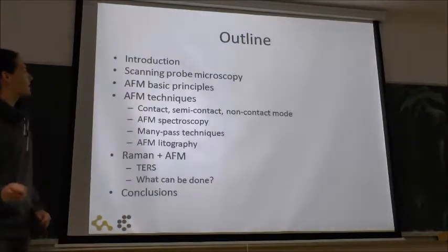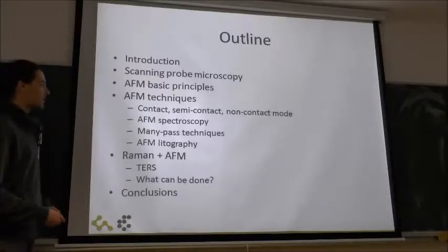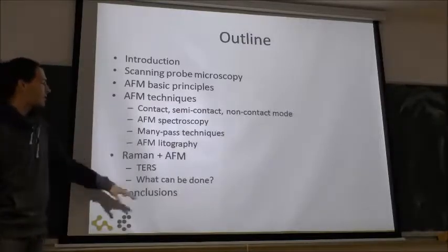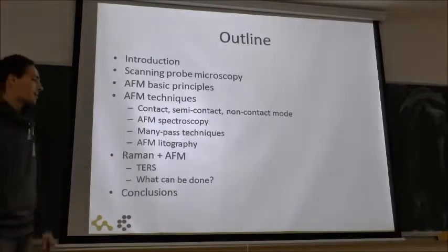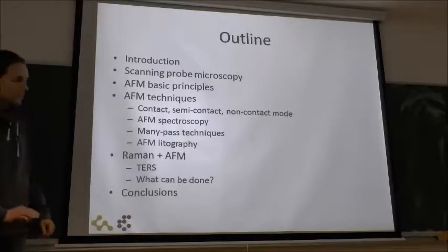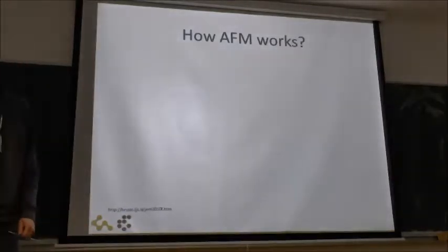Then I will say something about scanning probe microscopy, about the AFM basics and techniques, and after that I will come to the combination of Raman and AFM, some special techniques, and what we can do with the system. So first, how AFM works.